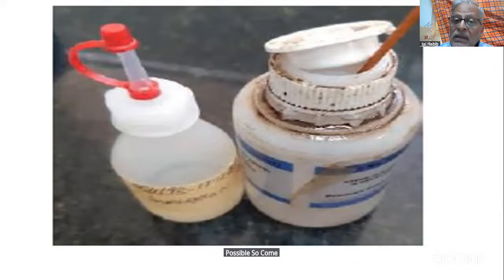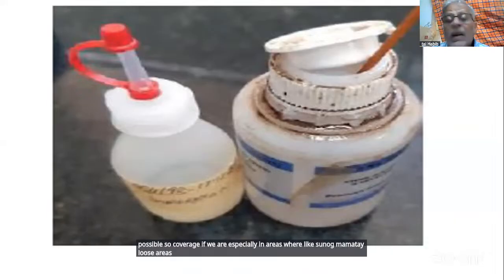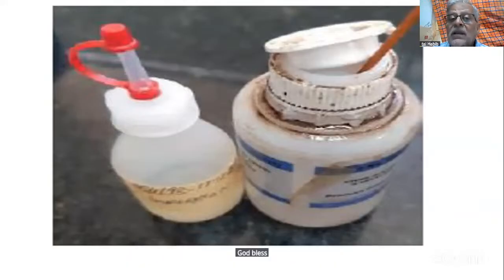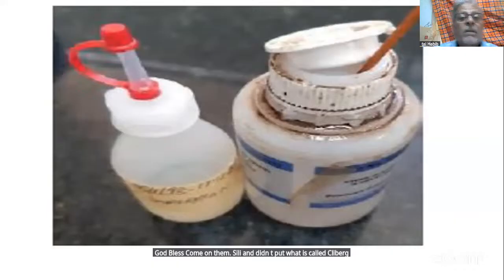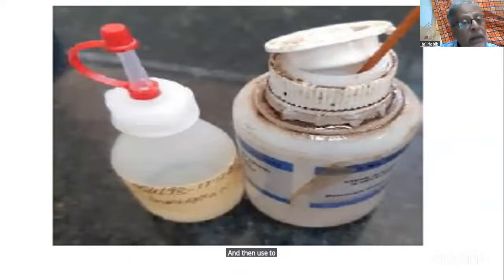So cover it. If you are especially in areas like Kisumu, Mombasa, those areas, your microscope has to be covered twice, with two garbage bags. Cover them, seal it, and even put what is called silica gel in it to absorb any water. And then you store it inside a cupboard.